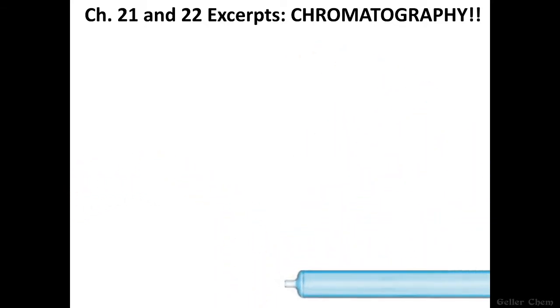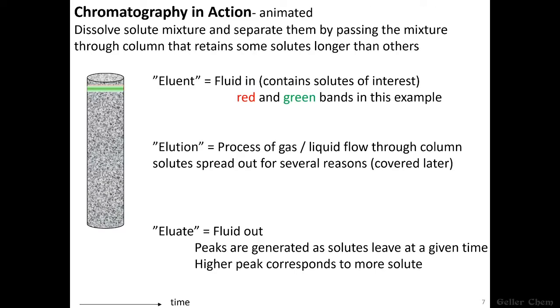And for the next few videos, we're just going to go over fundamental ideas behind this technique before we get into actual analytical uses. So first I'm going to show you a visual of chromatography in action and define some terms, and then we're going to write down the key points and try our best to mimic this visual with drawings. Now let me give you a primer for what you're about to see.